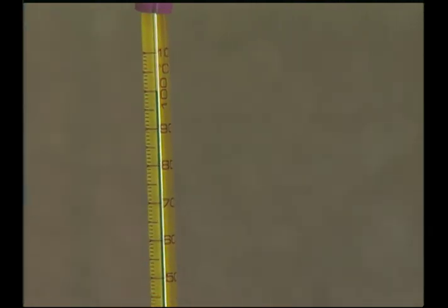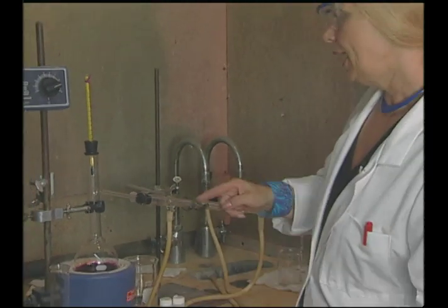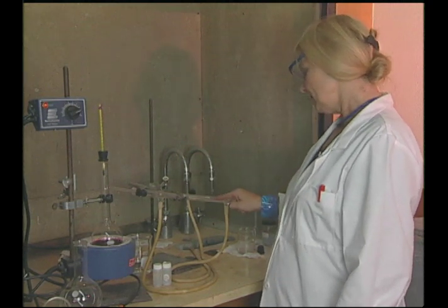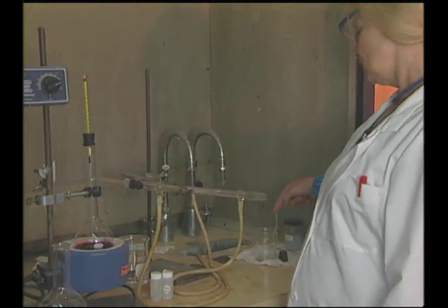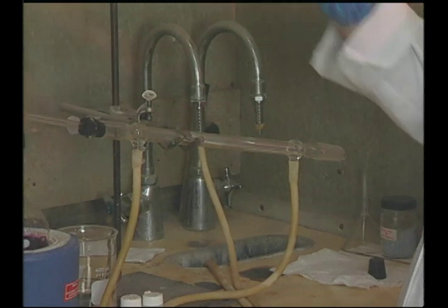which is water. So you see, distillation is always also a technique in determining the boiling point of a liquid. And then when we move here through the condenser, you see the water here really sliding down beautifully and then dripping into the receiving flask. And look at the color of the distillate. It is colorless, so that means it is pure water.